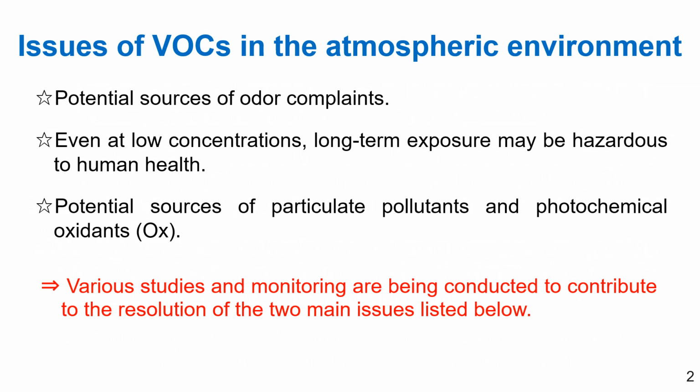From here, we would like to focus on the observation of VOCs that contribute to the formation of photochemical oxidant and introduce the application of the Canister GC method.